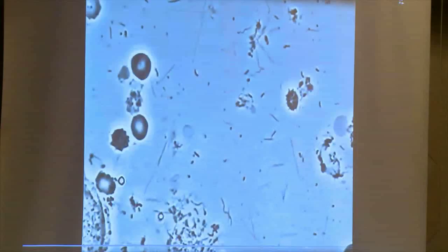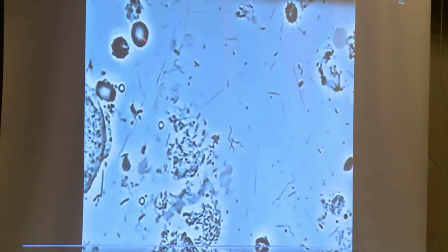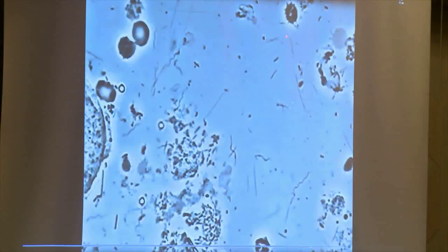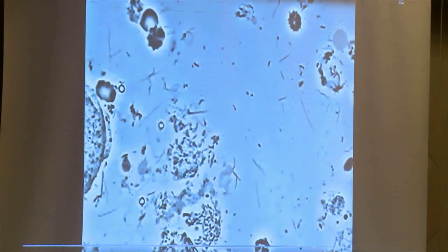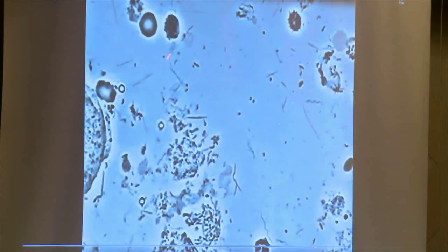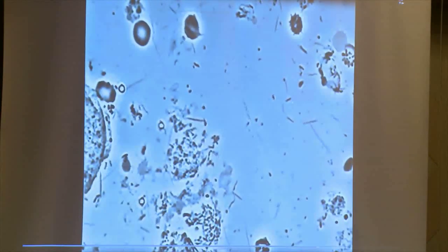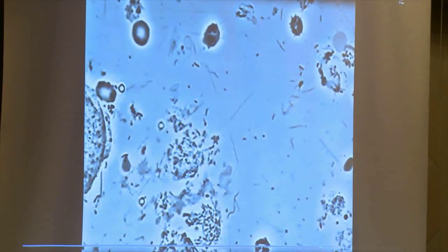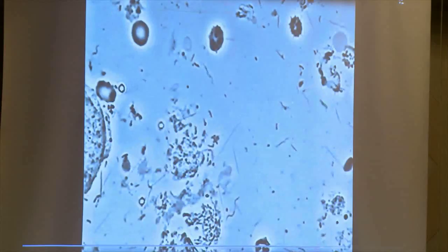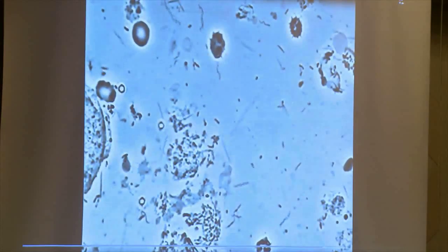Well, here it is moving again. We've got some red blood cells over here in the corner. Red blood cells, mostly here. You can see more of the spirochetes, the gliding rods. There are large, massive spirochetes that are all attacking a white blood cell. It's quite interesting when you see it in a big circular pattern, and they're all just attacking it at the same time.